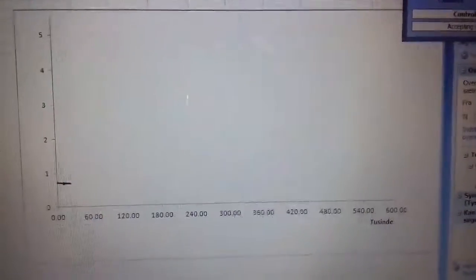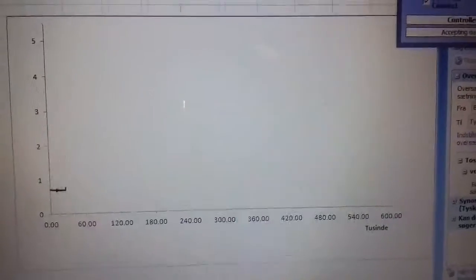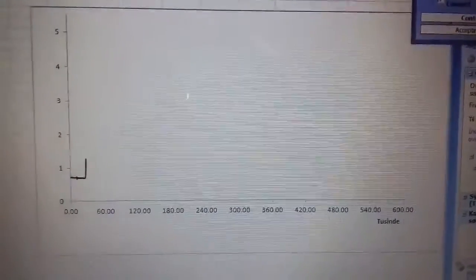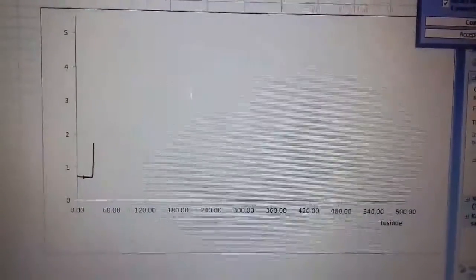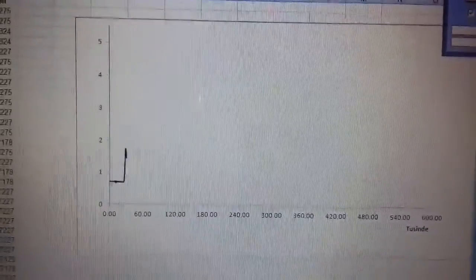The sample injected is a propane-butane fuel mix and it also has some air. That's the air you see there. That's an unretained peak.